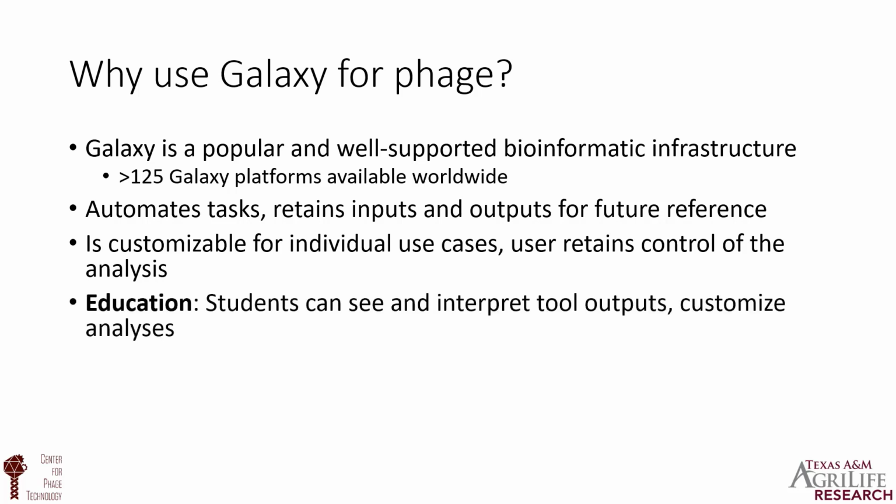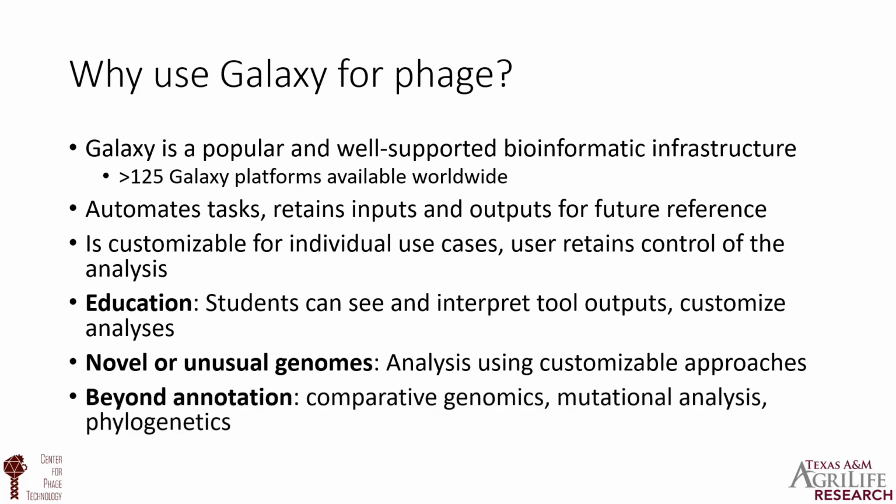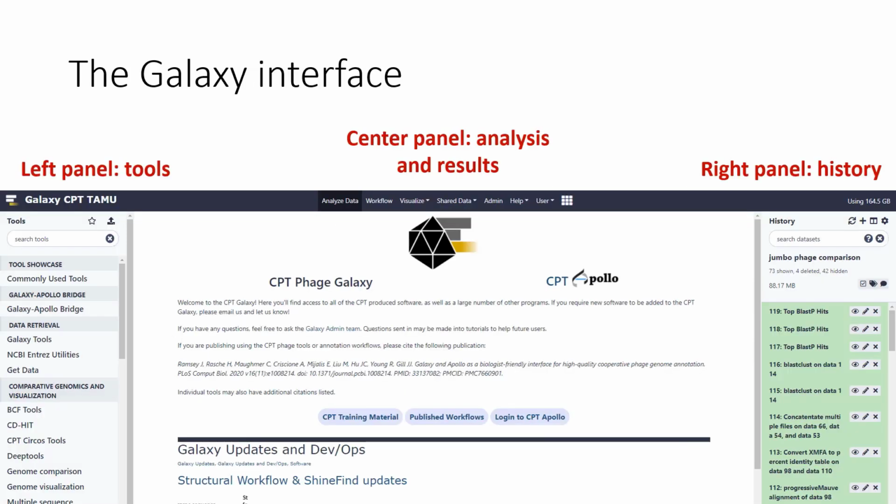It has uses in education where students can see and interpret their tool outputs and customize the analyses themselves, which is an advantage over the fully automated annotation platforms that are available. It's useful for novel or unusual genomes, which will permit the user to customize or modify their analysis approaches. It also allows the user to go beyond annotation to conduct comparative genomics, mutation analysis, and phylogenetics.